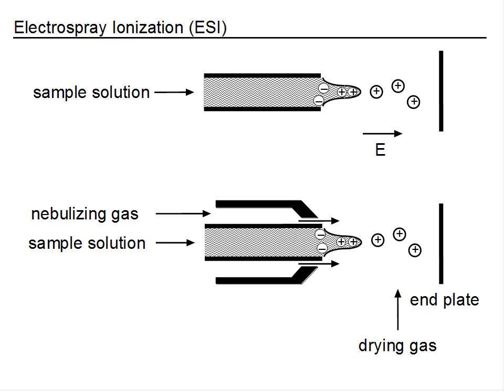As there's lots of solvent coming out of a chromatography column relative to the high vacuum needs of a mass spectrometer, we need some help to evaporate this solvent. This is generally done with a so-called drying gas. Most of the time this is nitrogen that is heated to maybe 200 or 300 degrees, or maybe even more, to quickly evaporate, for example, methanol, water, and formic acid, which are typical components of reversed phase liquid chromatography.